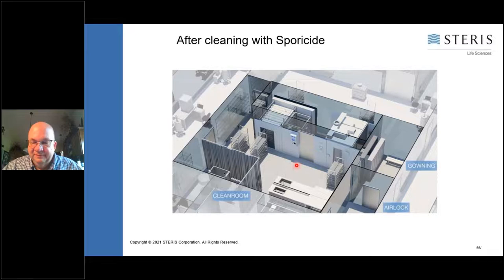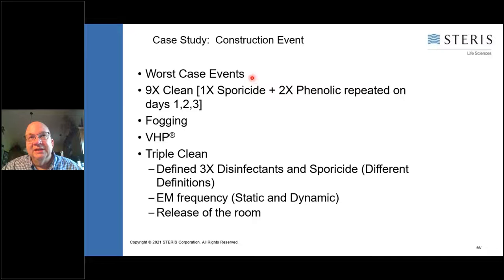So there are different options for doing the field trial. You want to do it, obviously, always after a worst case event. One of my colleagues in the industry, Anne-Marie Dixon, who's an independent consultant, she recommends a lot of times to do a 9X clean. That's, for example, doing a triple clean three times in the clean room and taking EM data either at the beginning or at the end or after each phase.